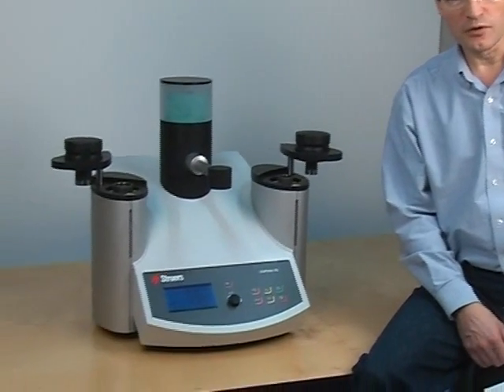We have built a new press which is setting new standards in terms of speed, functionality, and ease of use. And to match every requirement, we have built three different models. So when you are thinking mounting, think CITAPRESS: speed, ease of use, less mess. We look forward to giving you a full introduction to CITAPRESS on our e-training module, which will be available soon.